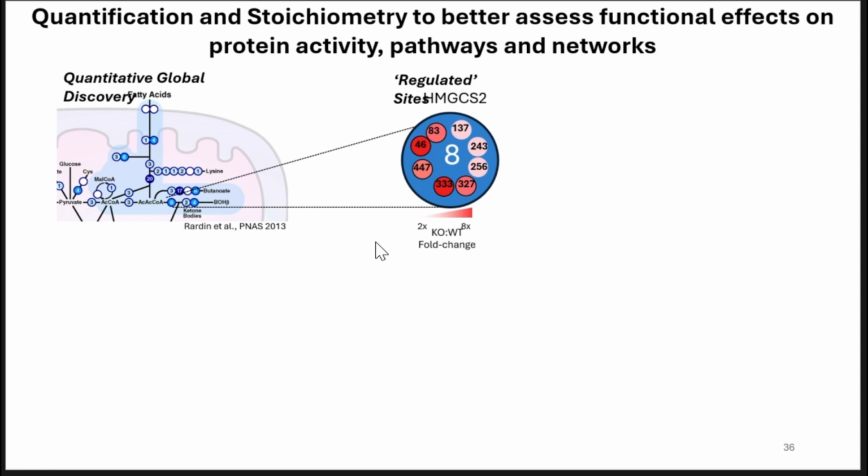And actually, I really love to do dynamic studies with post-translational modifications because often you see trajectories. Some sites you see a really super strong increase of maybe succinylation, maybe starting very early and then going up and up and up. Others you have maybe a more slower start of regulation, and some PTM peptides may actually plateau. So these are all down the road analytical challenges for a search engine.